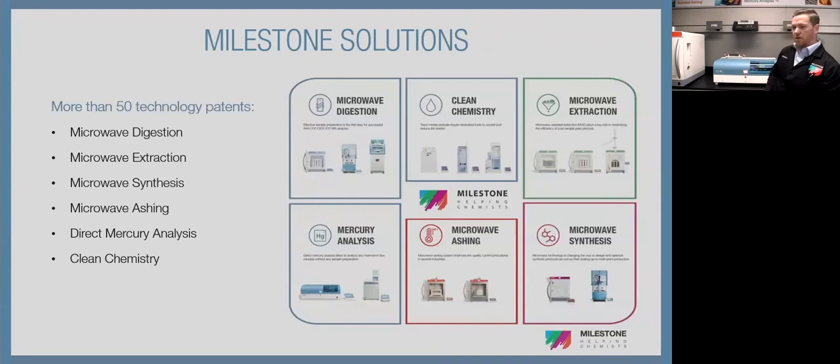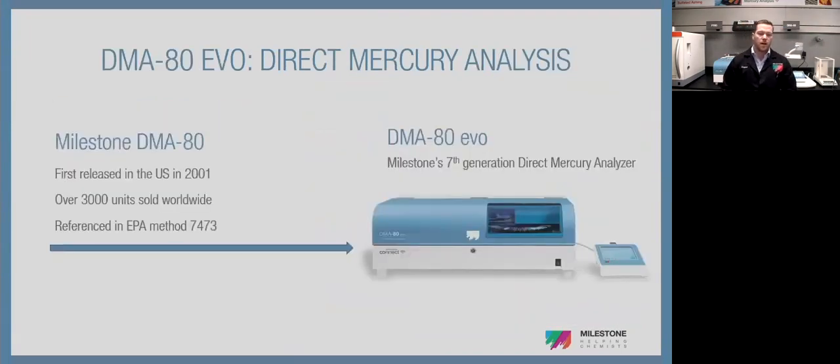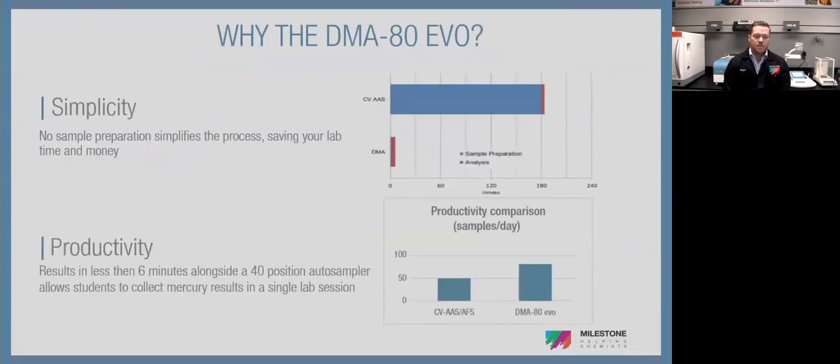Our first sample just kicked over — we finished that run. Now it'll cool off and inject the second sample. The DMA80 was first released in 2001 in the U.S. We have over 3,000 units worldwide and it is specifically referenced in EPA method 7473 — direct combustion and amalgamation of mercury. The system behind me is our seventh generation platform from around 2019. People love it because there's really no sample prep — you just weigh out the soil in a boat, place the boat in the system, and press go, giving very high throughput and much less labor cost than traditional methods like cold vapor AA.